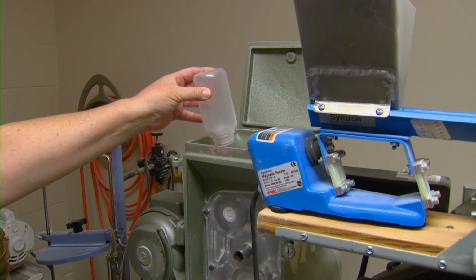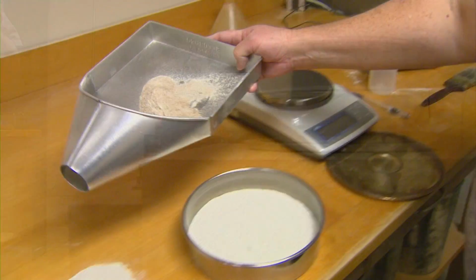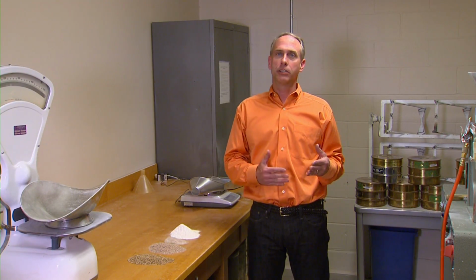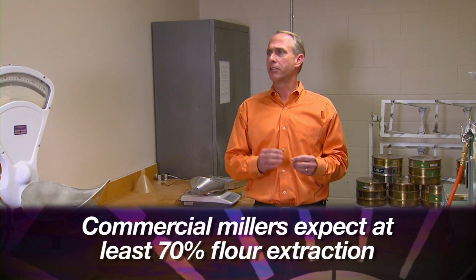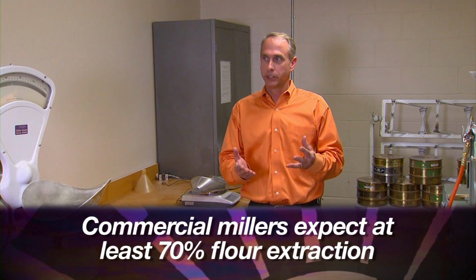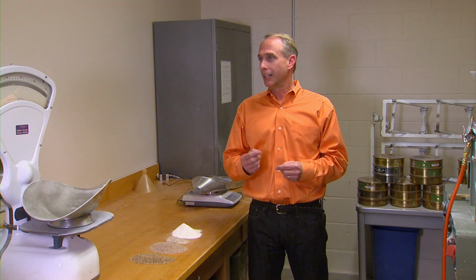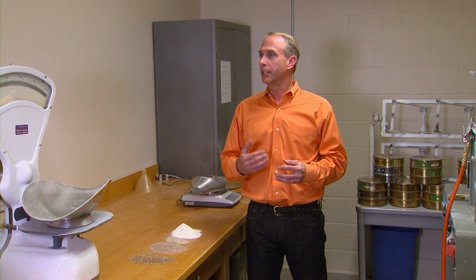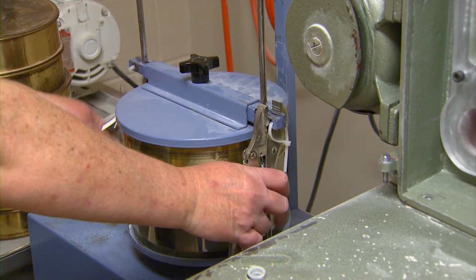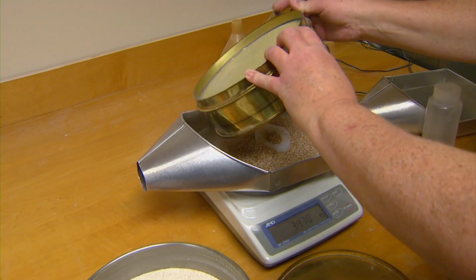The process starts with the team looking at the kernels, measuring size and hardness before milling the grain to extract flour. Now, we talk about soft versus hard, but there are still different grades, different finer levels of hardness. So a softer hard wheat, which we would still find acceptable for processing and commercial baking, allows us to generate a little bit higher flour yield because the mill is just scraping that flour a little bit better off the bran. This is also where they look at protein, both the amount contained in the kernel and the quality of that protein.